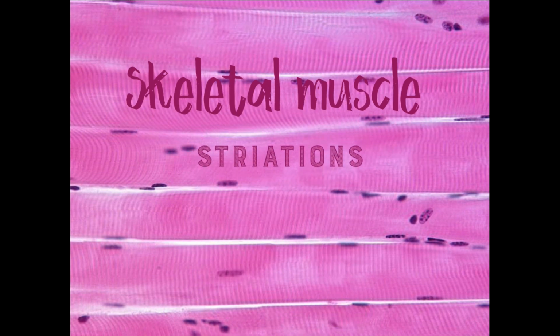And the other thing that you might notice is the striations. Now, it's kind of subtle, and it may look like a mistake in the slide, but if you look very closely at each one of these muscle fibers, you're going to notice an alternating dark and light coloration. It's dark, light, dark, and this is in every single one of the muscle fibers. Later on, when there's an entire chapter dedicated to muscle tissue, we'll go more in depth into what those differentiating colors are. But just for now, notice that each muscle fiber has an alternating dark and light striation.